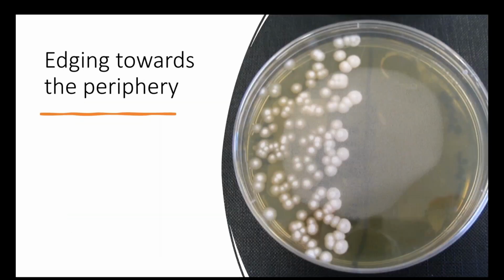On this image, we have a problem of poor mixing, again with a pour plate, and samples being pipetted in, the plate's not been adequately mixed, and we've got a congregation of colonies on one side of the plate, and starting to get some confluence there that can make it hard to discern the actual numbers.